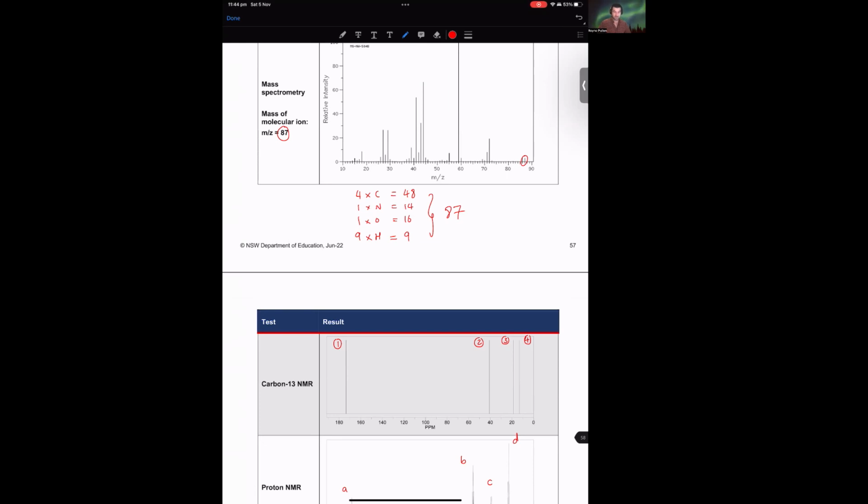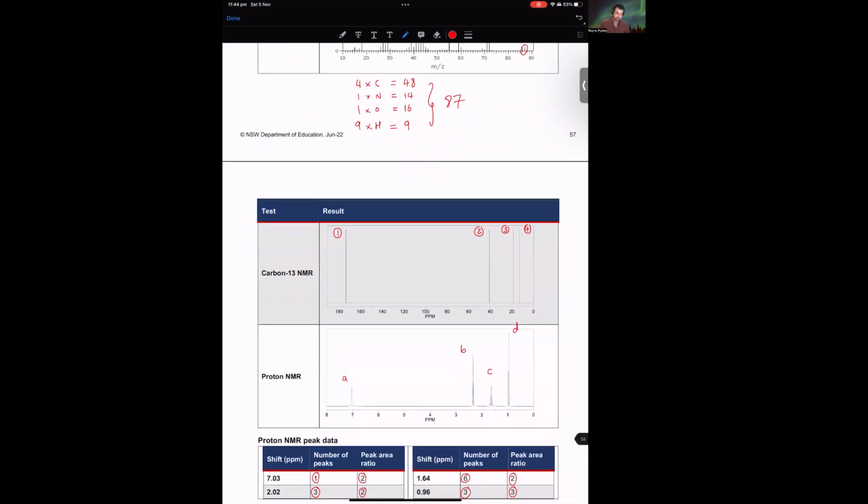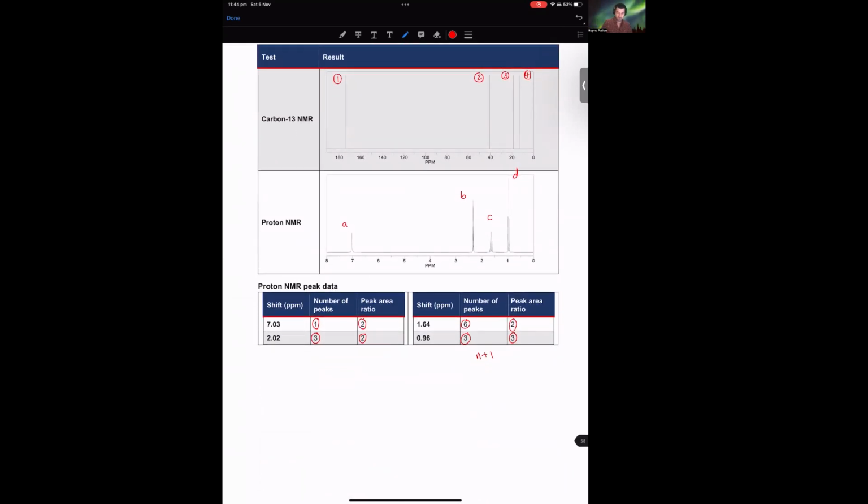So the last thing we need to do then is work out, well, what does the structure look like? We know that there's a carbonyl. We know that there's an NH2. We know that there are some carbons present. And I think this is where the positioning or the shifts of these carbons comes in handy, as well as what we see in the proton NMR. We'd already established that there must be a terminal CH3 to a CH2 to another CH2 to a carbon that has no proton on it, hence why we see that triplet for peak B. And that would then suggest that this is probably where our carbonyl is, as well as our amine. Now, depending on how much you've done in terms of organic functional groups, if you have a carbonyl next to an NH2, we actually call this an amide.